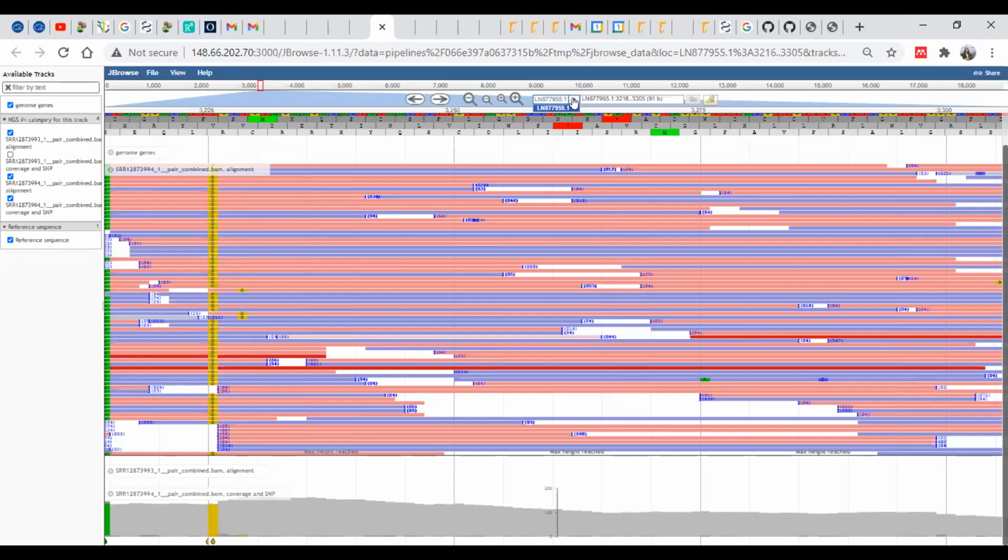As you go through these examples, try to spend some time to look at the input data, the reference genome, the different types of outputs, and what the outputs actually mean. What do they tell you? What is the information included in this example?